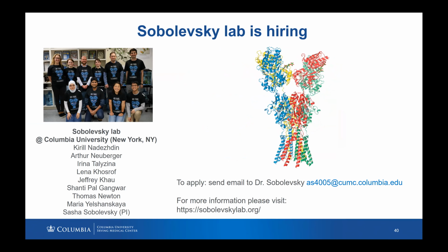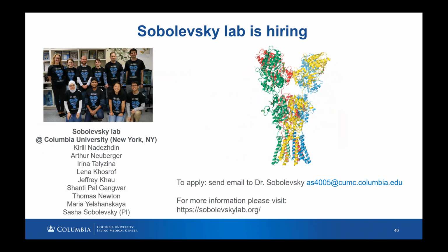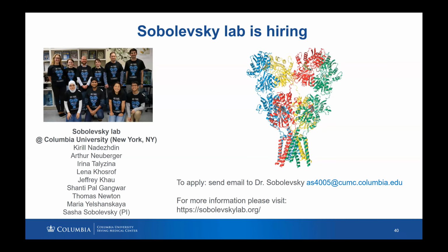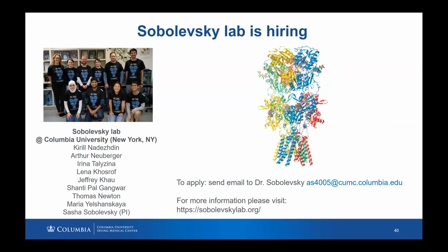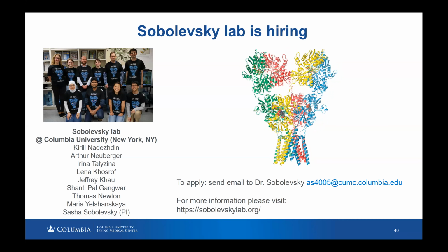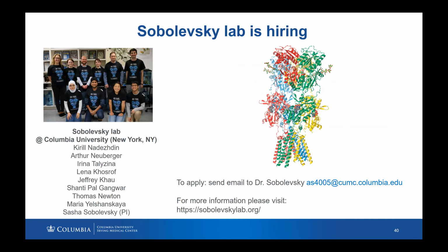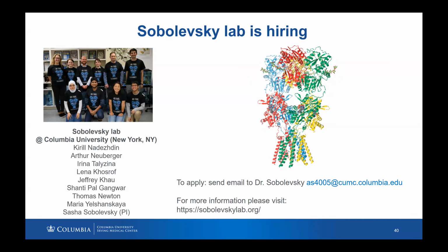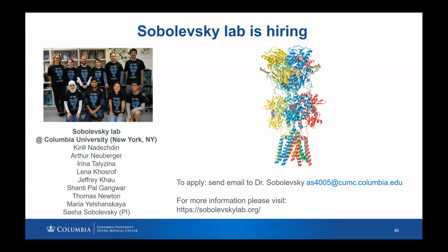One question, I think this is still important, even though they seem to have answered the question themselves. The contrast of particles looks super nice for such a small protein. Just out of curiosity, could the increased signal to noise come from use of nanodiscs? Yes, so we think so. Actually, the contrast is better in our hands for the protein that is reconstituted into nanodiscs.